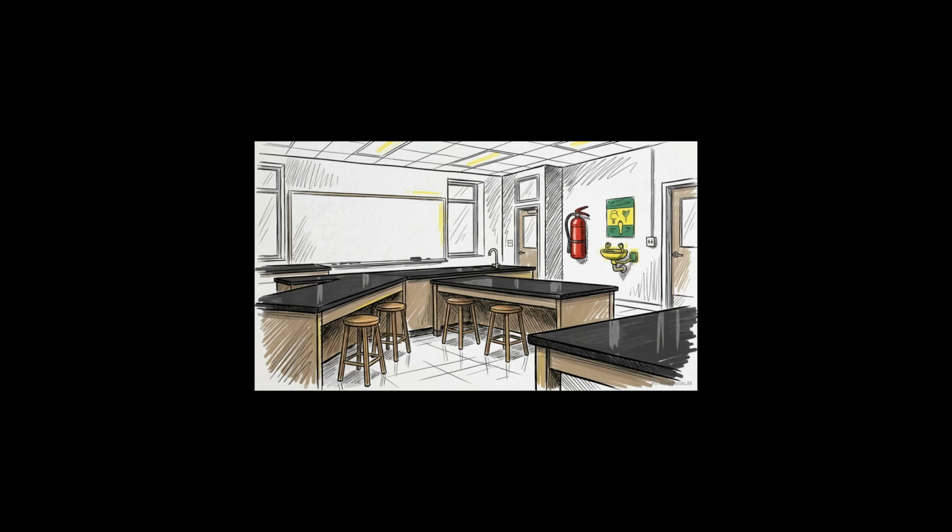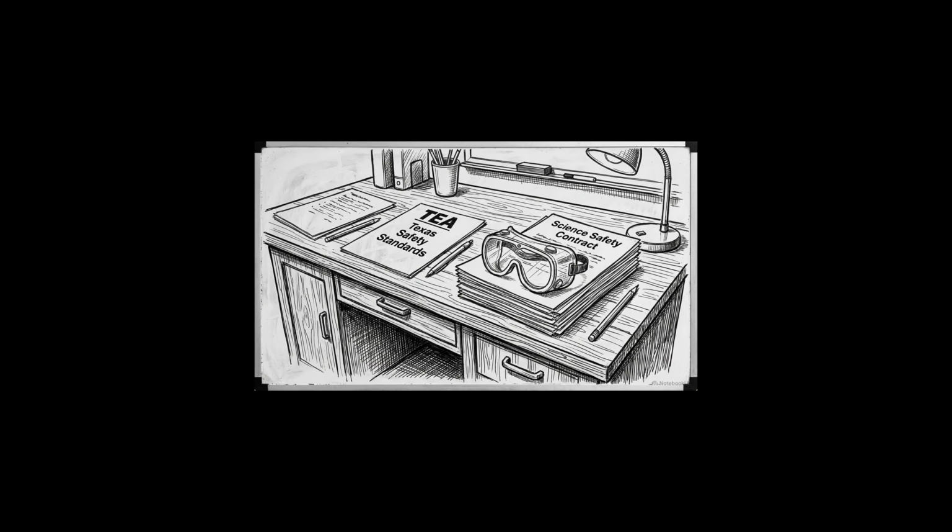With the student flushed and the fire fully extinguished, the emergency simulation is successfully resolved. Navigating an event like this proves why preparation matters. Integrating signed contracts, spatial mapping, and precise physical emergency responses creates an environment that is both safe and legally compliant.